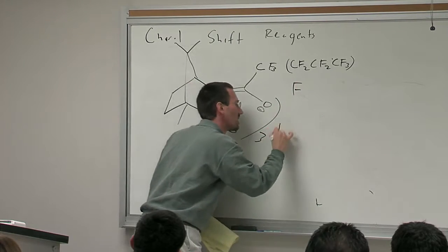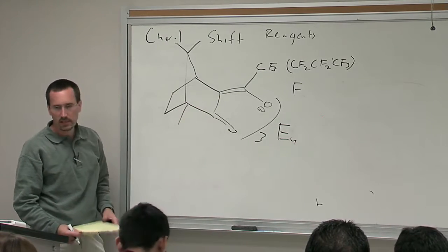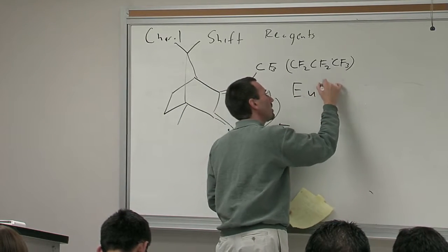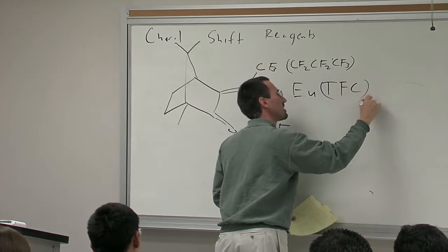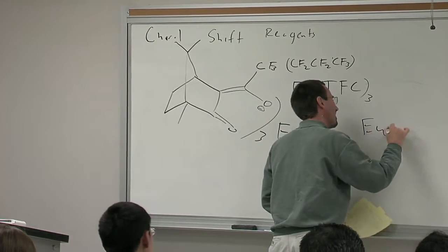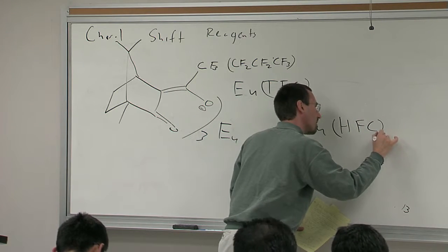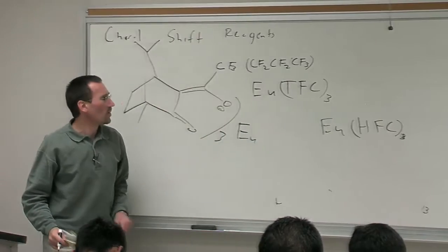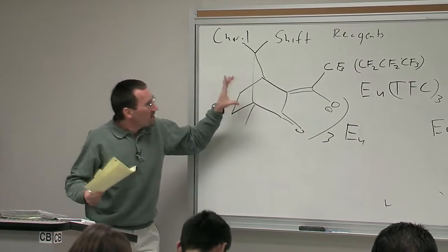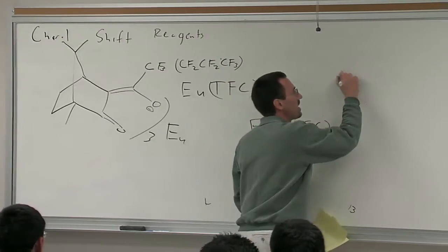So you have three of these on a europium, just like we did with the other type of ligand, right? It's just another acac ligand. And so you have the reagents that are called Eu(tfc)3. TFC stands for trifluoromethylcamphorato, or Eu(hfc)3 for the heptafluoropropyl camphorato.